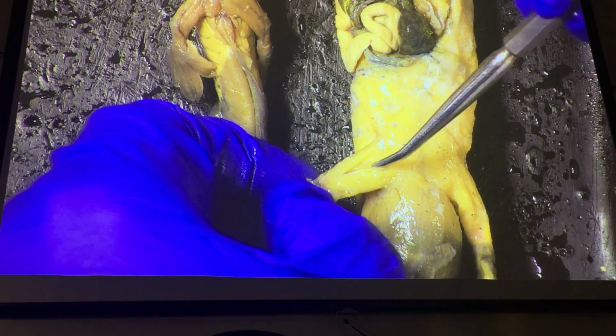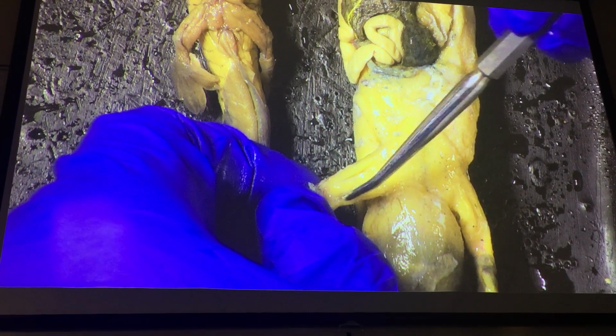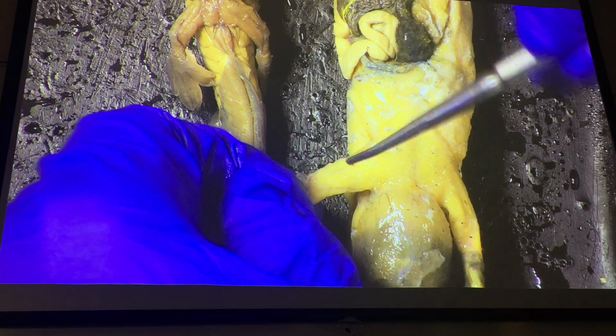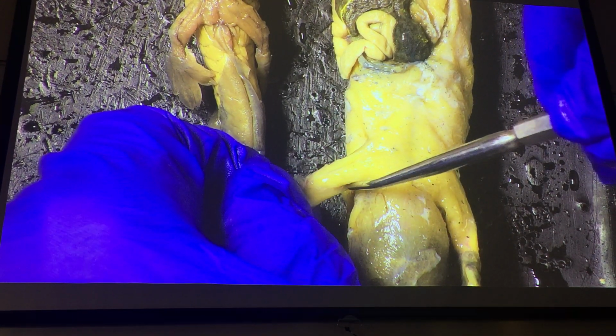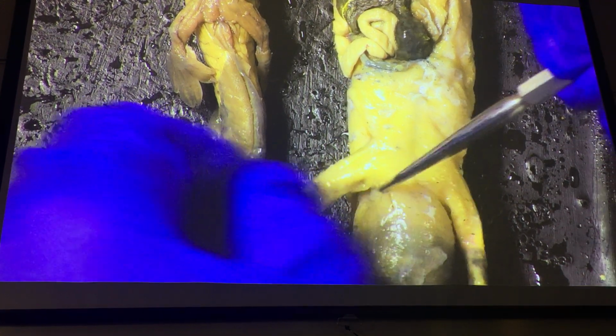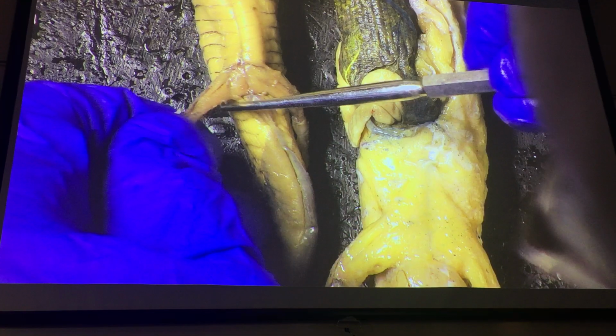Shorter muscle here, pubo-tibialis, pubo-ischiotibialis, and then the muscle that kind of hangs off the back of the leg like a hamstring, which flexes, is the ischioflexorius. I find that to be really useful. Now we look at these little guys. Muscles are better defined, no doubt about it, but they're tiny.